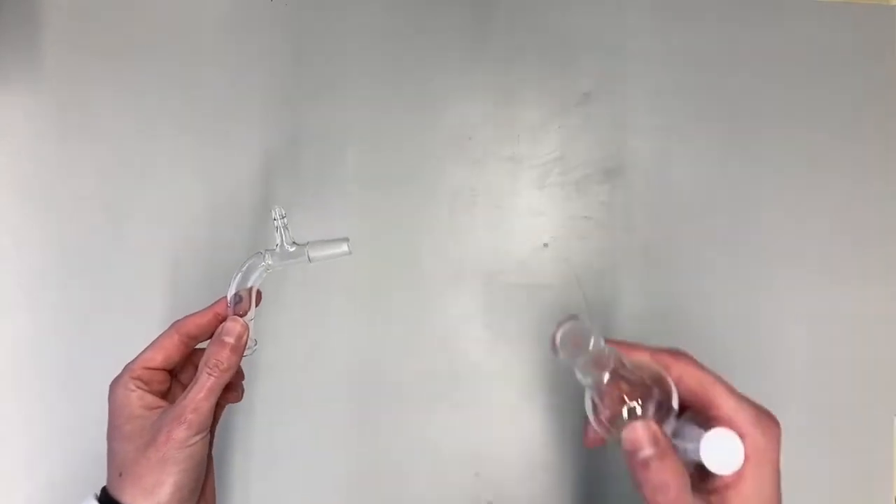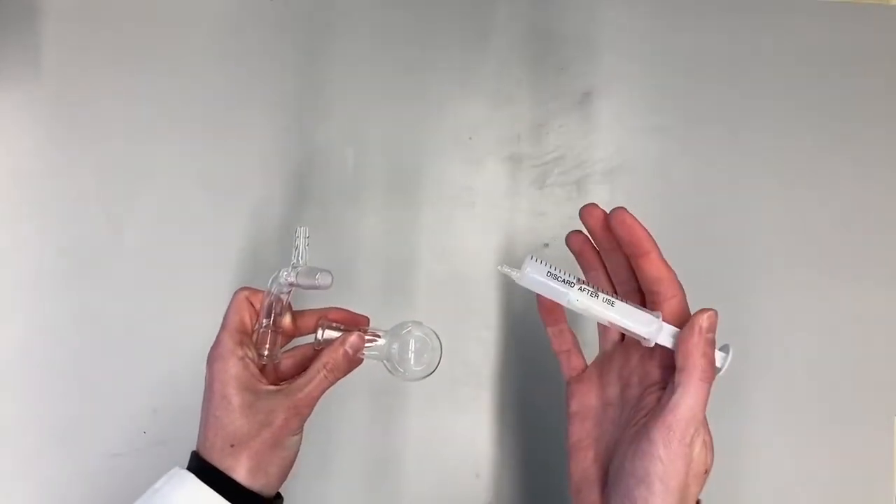In this video we will show you how to grease your joints. For this video demonstration you will need a male joint, a female joint, and some grease.